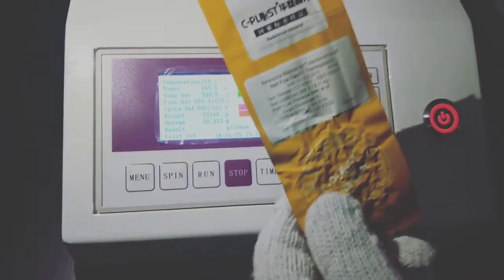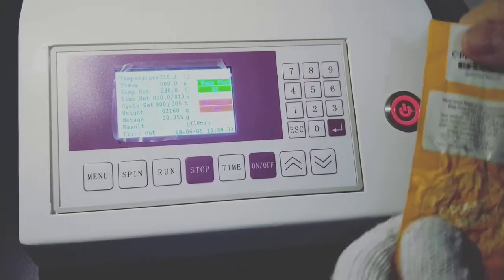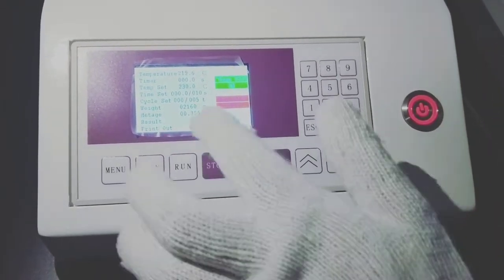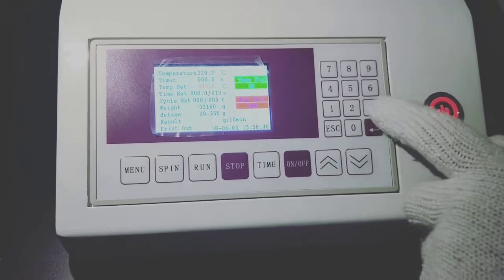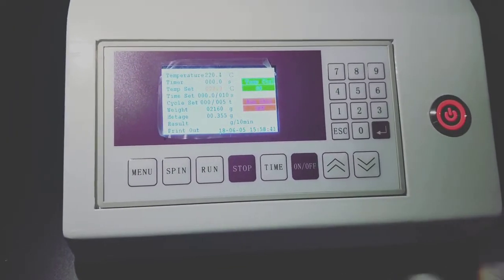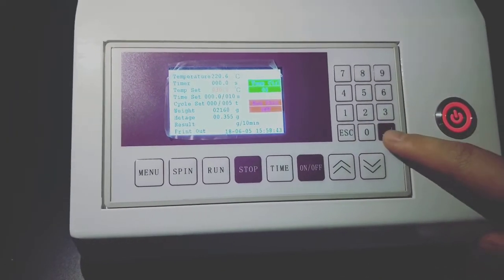For example, we use this standard material to do the test. Its testing temperature is 230 degrees. We input 230, then press enter.